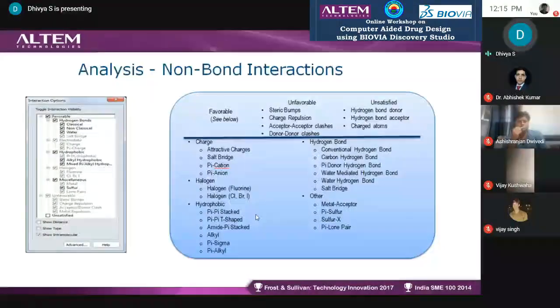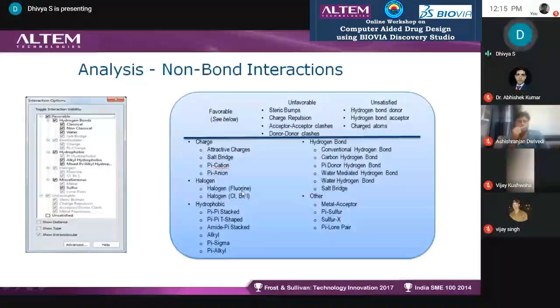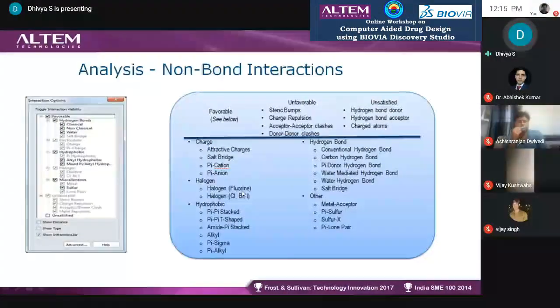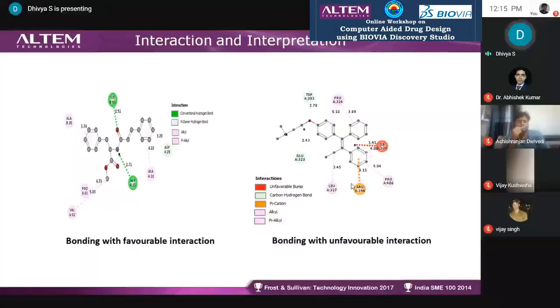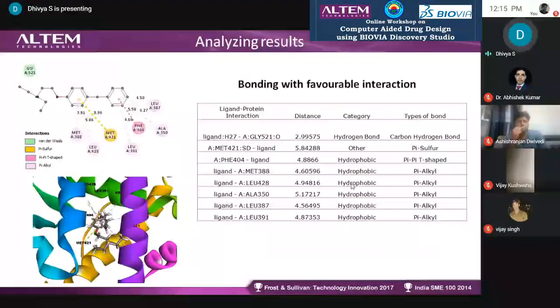When interpreting results, you may also see some unfavorable interactions. For the analysis process, you should avoid unfavorable interactions and prefer only favorable ones. This is a 2D representation of interaction features. The results are not generated manually — they are all created automatically, and we just copy and paste into an Excel sheet or wherever you want to present the results.